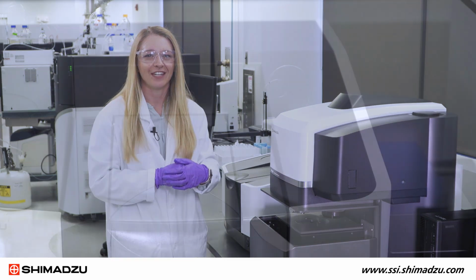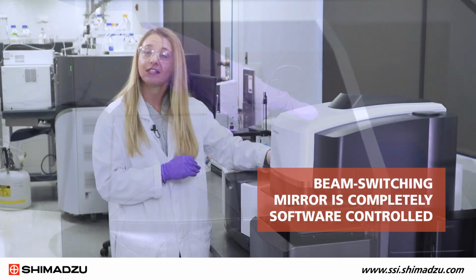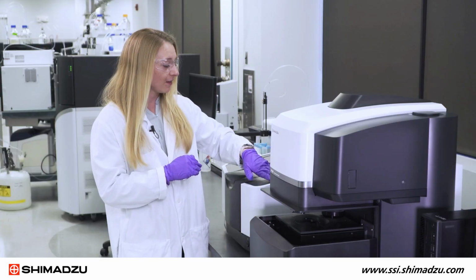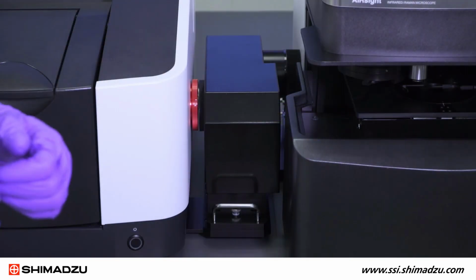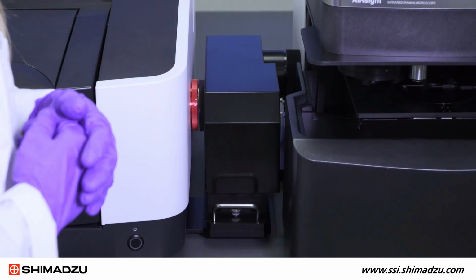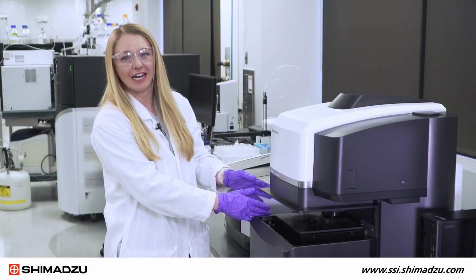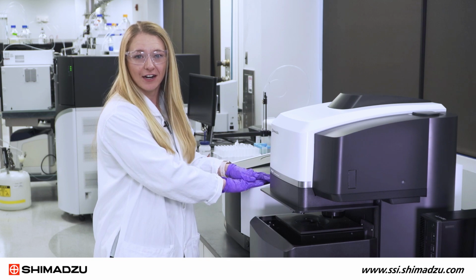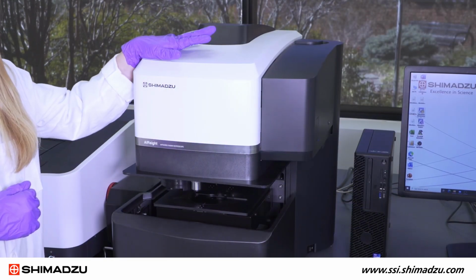There's a beam switching mirror on the right side of the FTIR bench that's completely software controlled to divert the beam either internal to the sample compartment or external to the microscope. In between the FTIR bench and the AIRsight microscope accessory is the transfer optics, which is two additional mirrors inside to redirect the beam from the IR bench to the microscope. Finally, to the right is our AIRsight microscope accessory.